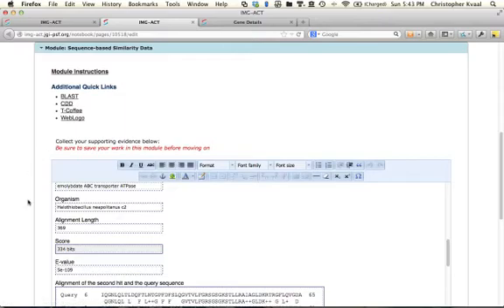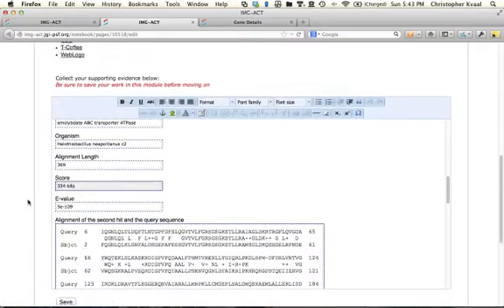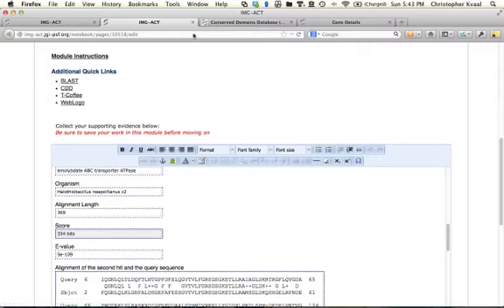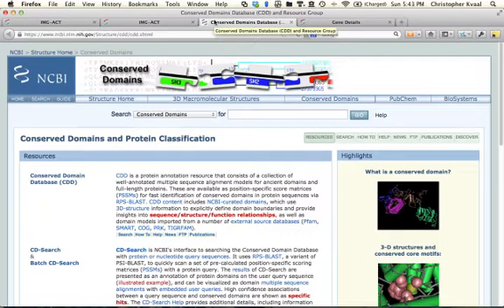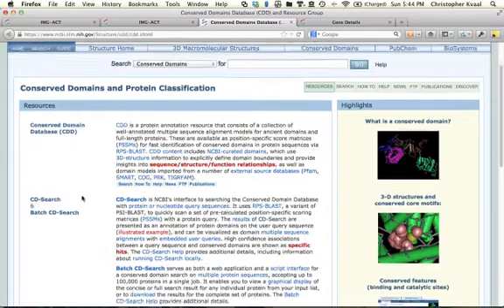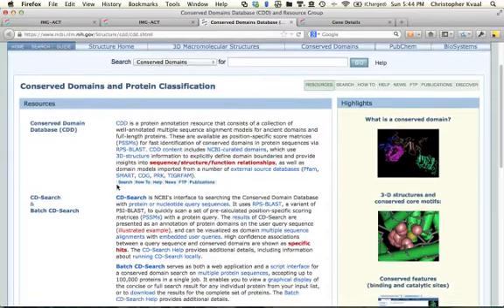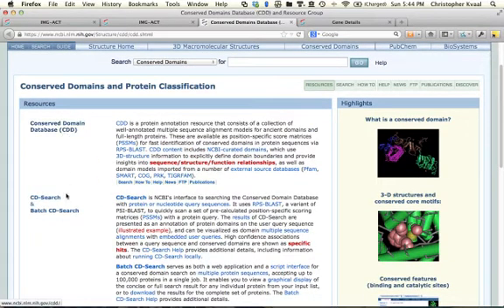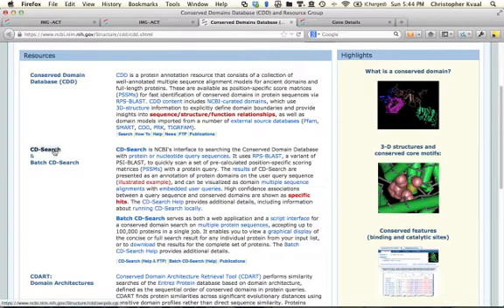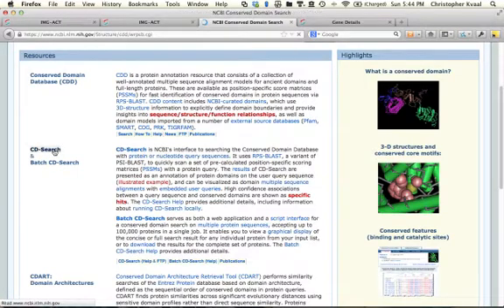I'm going to go back to my Sequence Based Similarity module. I'm going to open the Conserved Domain Database link in a separate page, and I'm going to start with a Conserved Domain Database search right here, clicking on this one.